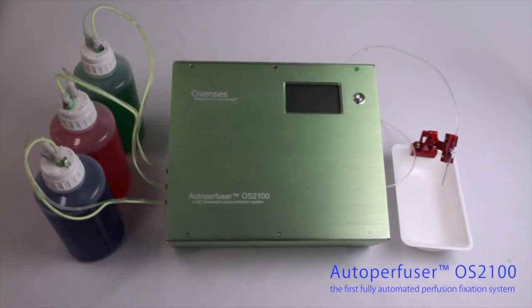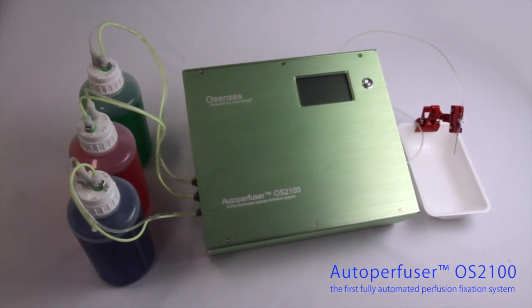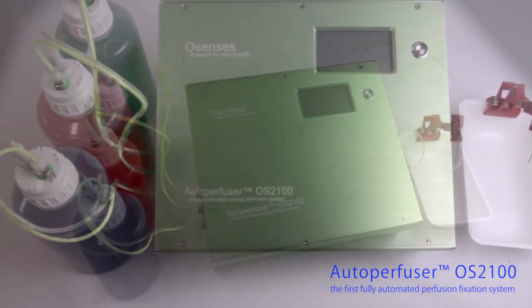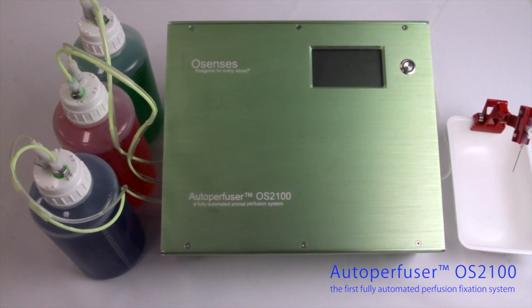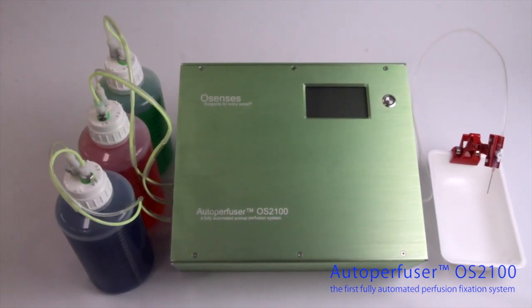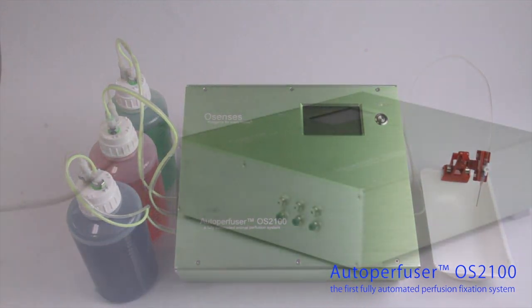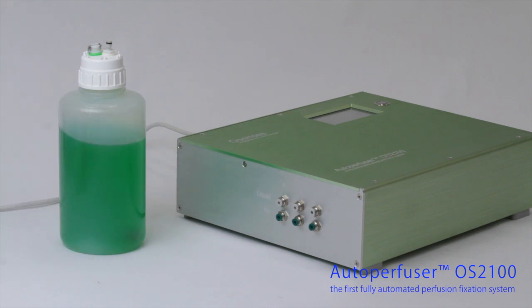The Osensis Autoperfuser is new and unique, and has been engineered to precisely address these problems. It is the only fully automated animal perfusion fixation system available, and it allows the pressure, volume, and duration of the perfusion to be programmed. The Autoperfuser is equipped with three inlet bottles that can be individually programmed.